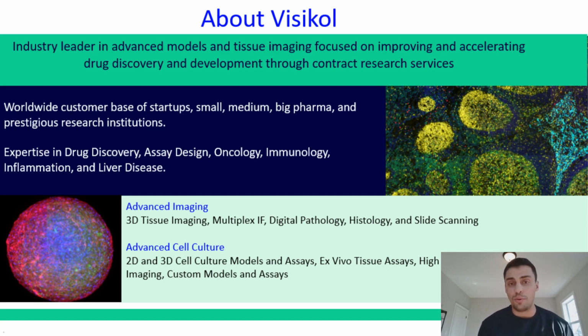But for us, we do 2D and 3D cell culture models and assays, as well as ex vivo tissue slice assays with a strong focus on high content imaging endpoints. And we do a lot of work on custom model development if we don't have a model or we don't have a model from a third party that meets the needs of our researchers.